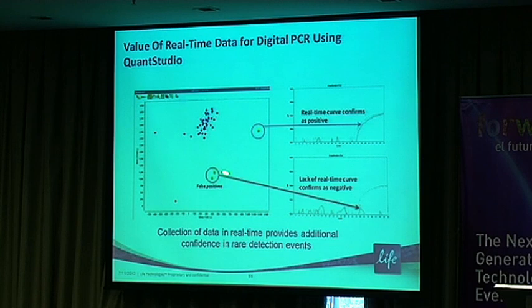So by combining digital PCR with the genotyping cluster calling or gene expression data, we can go back and look at these two data points as an example and say, okay, was this real or was this not real? We go back here and say, did we see a CT value? Did we actually see an amplification plot come up? Did we see exponential rise? In this case, we didn't, right? It's pointing to this area here. It's hard to see, but over here there's no amplification. So whatever this fluorescence was, it had nothing to do with true amplification of your target. So it allows the researcher to go back and actually rescue ambiguous results. This was never really possible before. And then with this one sample that occurs off cluster here, you get confirmation by going back and looking at the actual amplification curve that was generated.